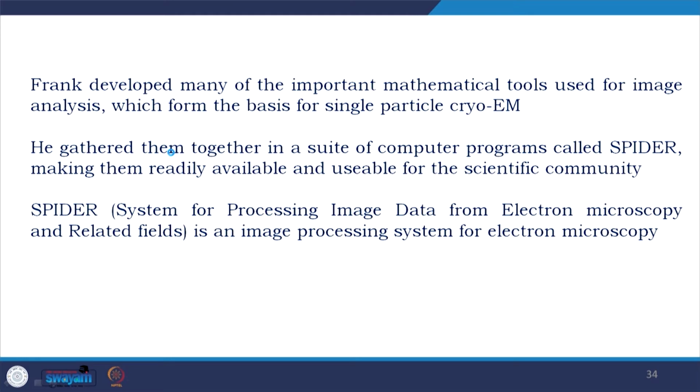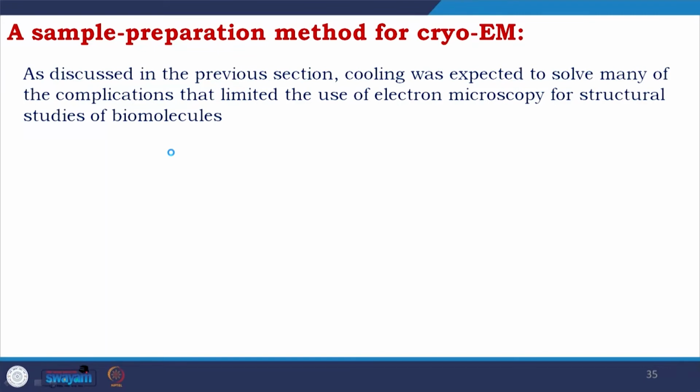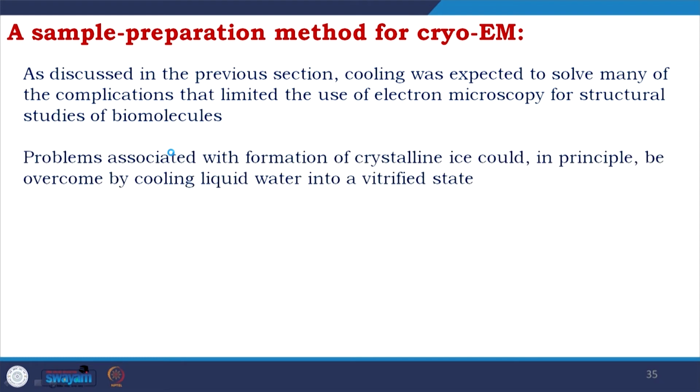So, we have already discussed the importance of sample preparation, how the sample preparation happened, what are the procedures and all. As we have also discussed in the previous section, the cooling was expected to solve many of the complications that limited the use of electron microscopy for structural studies of biomolecules, especially protein.